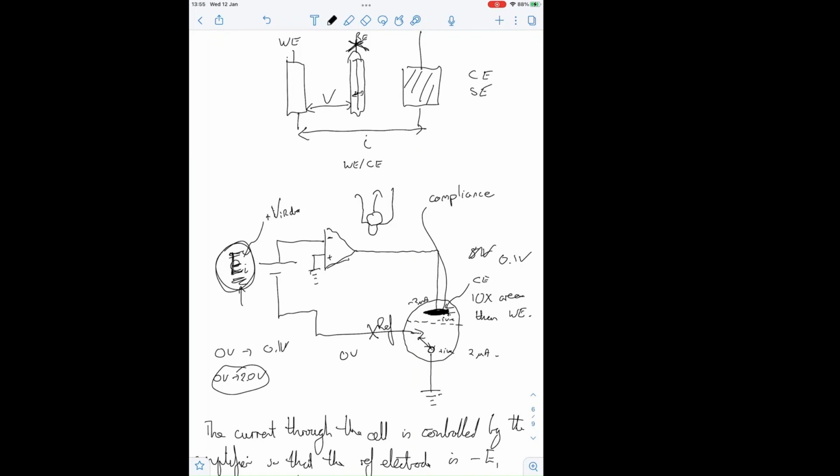Yeah, there's another time to check the circuit before you start, and that's if you spent 5 days making your working electrode, and you switch your potentiostat on and you have a broken contact, it'll drive the voltage to somewhere that can destroy that 5 days' work. So the more valuable your electrode and the more time you spent preparing it, the more it's worth checking all those things before you switch your potentiostat on.